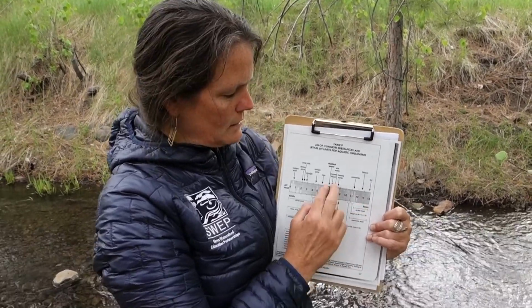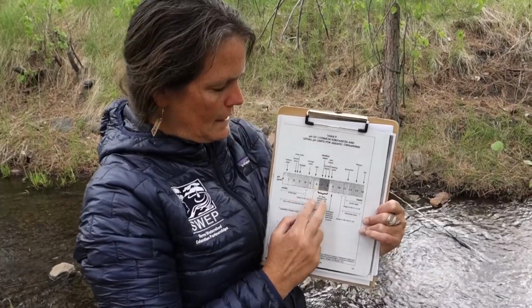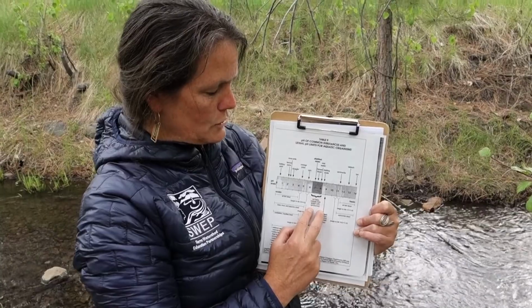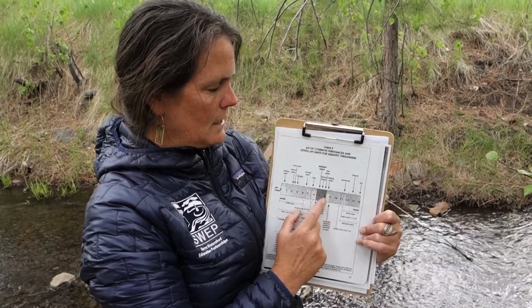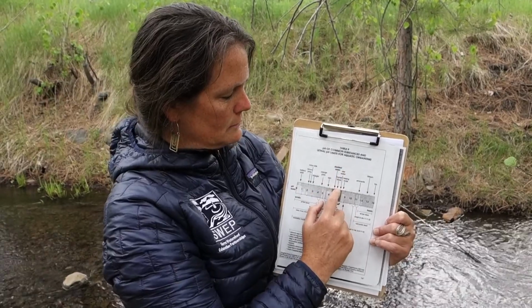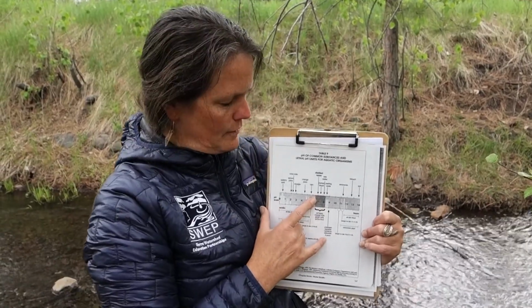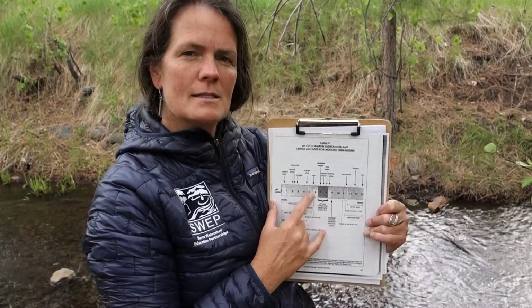So we want everything to fall right in the middle of the scale. 7 is considered neutral, and the optimal range for most life on Earth is between a 7 and an 8. So our drinking water, our blood, the ocean, all fall in that neutral range, and we hope to find that in the creek. Oftentimes our local creeks measure a little bit on the acidic side of the scale.